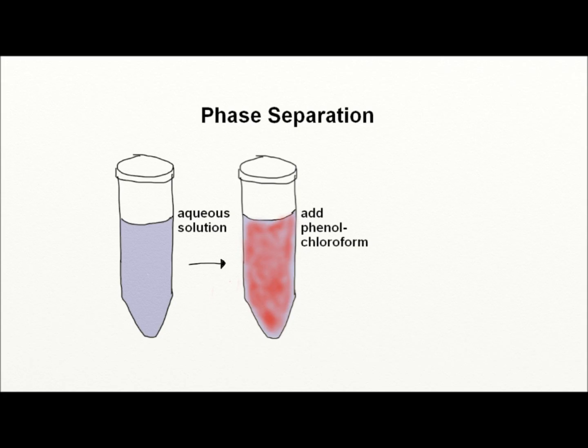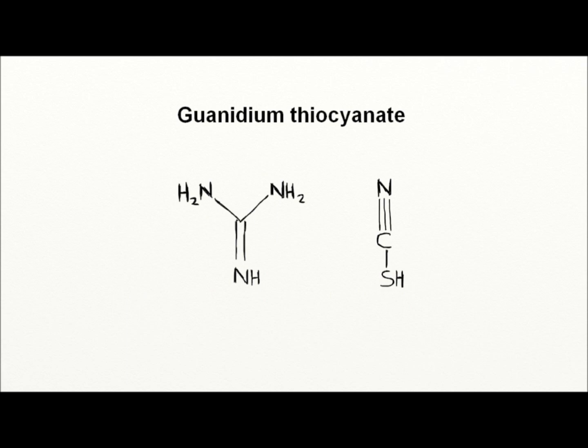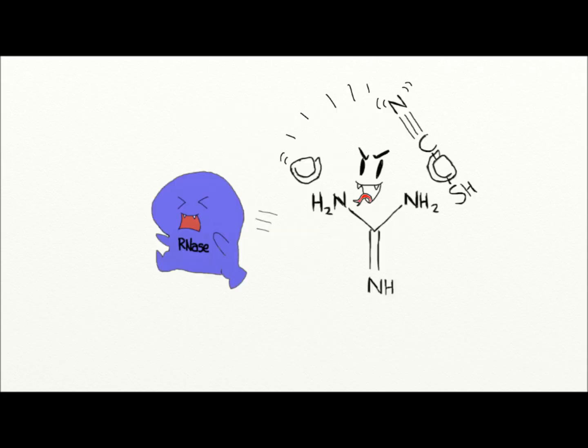This results in the formation of an upper aqueous layer and lower organic layer, consisting mostly of phenol. Guanidinium thiocyanate is a chaotropic agent that is one of the components of trizol and is important in denaturing proteins that may bind to nucleic acids or degrade RNA.